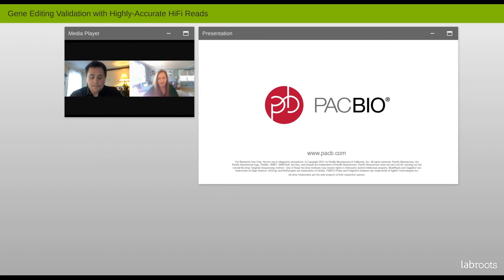Excellent. When you're doing PacBio sequencing, what is the recommended input material amount? This can vary depending on how big or small the experiment is. The procedure and checklist that I showed earlier for barcoding, we'll talk a little bit about that in terms of how many samples you're going to pool together to run a single experiment. If you're running a single experiment, the input will be a little bit on the higher side. It'll be a microgram at least of material, so that can be a little bit heavy for a viral prep. But as you start to pool more things together, or replicates, those inputs reduce, right? So if you were doing 4 samples, it would be a couple hundred nanograms per sample, and you match up to that 1 microgram lower level.